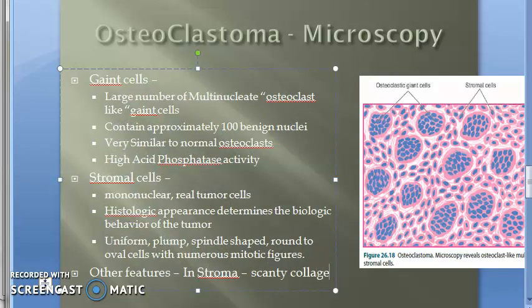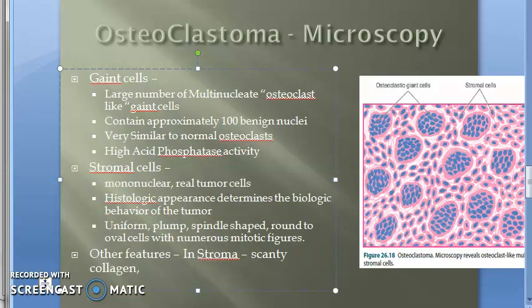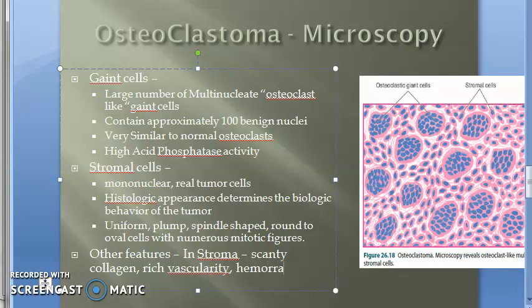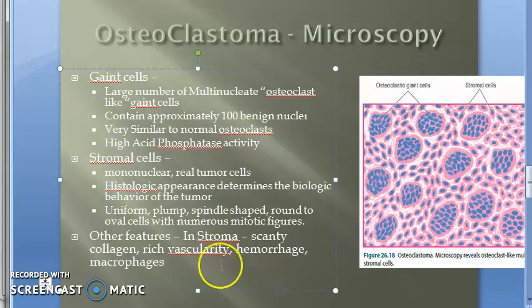So in summary, the stroma has: scanty collagen, rich vascularity, hemorrhage, and macrophages.